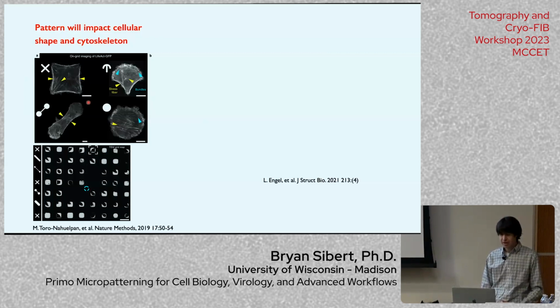I have not actually tried growing cells on continuous carbon film, purely under the assumption that it will break. I think the growing of the cells and the handling would break the 2 nanometer film, but I haven't actually tried it. Graphene would be a similar thing that could potentially be tried. But then again, there's concern about whether it is supportive enough that the cells won't break it. I'm not aware of anyone that has, but I think it would break, but it would be interesting if someone tried.